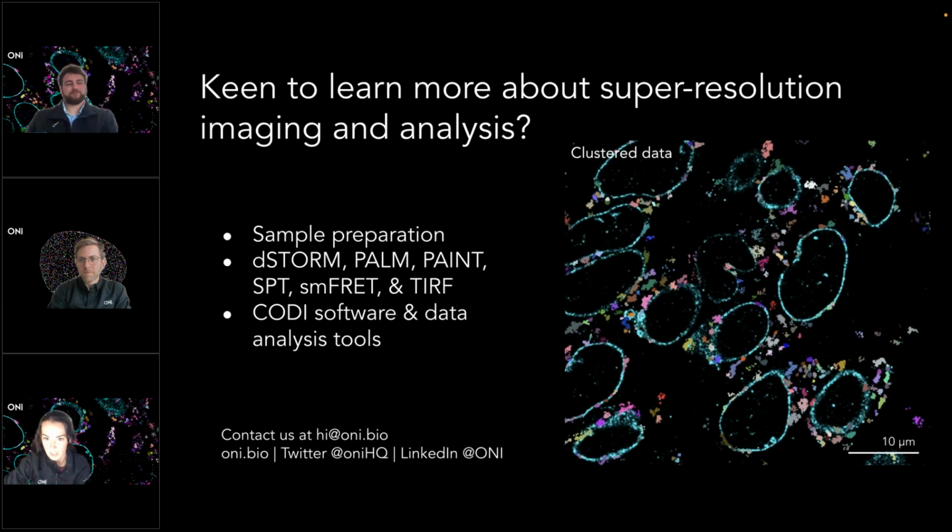For the first question, how can I best determine whether two proteins are co-localizing within the same structure of interest?